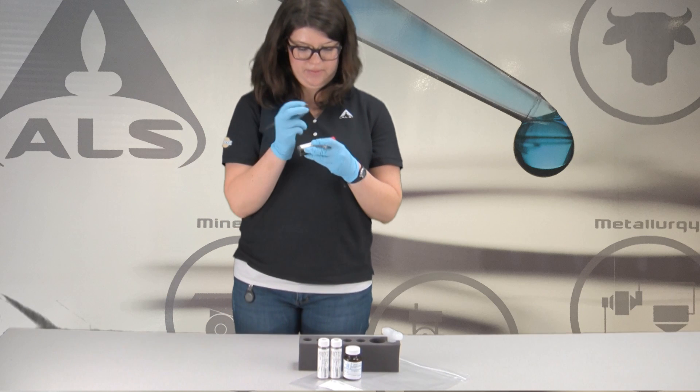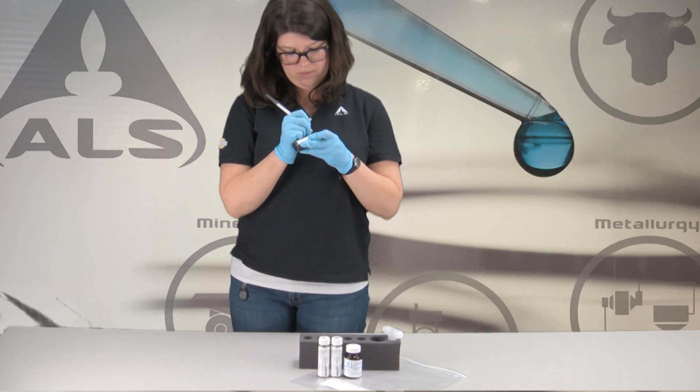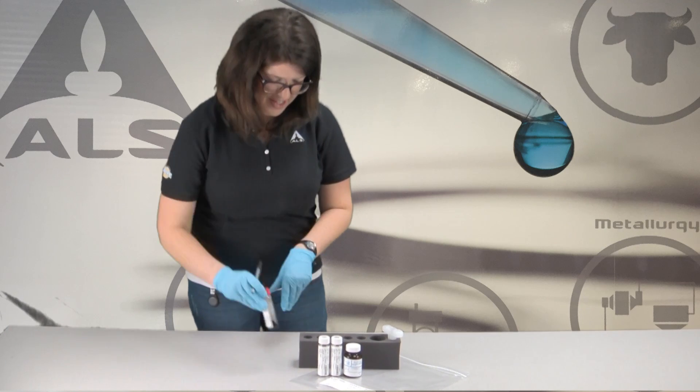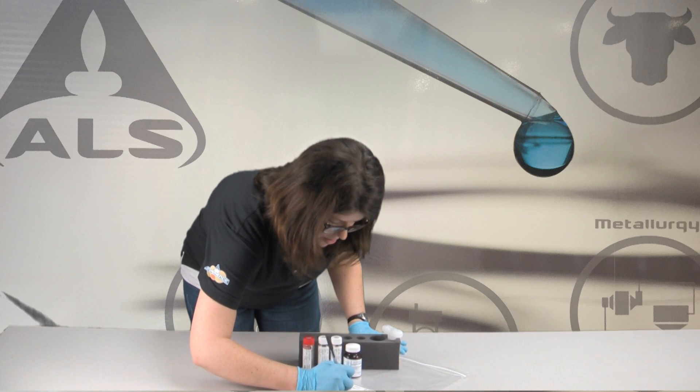Please complete each pre-labeled vial. Do not affix an additional label to the vials as it will alter the tared weight. A large label will be affixed to the outside of the ziplock bag that has a space for your sample ID. Please complete this portion of the label.